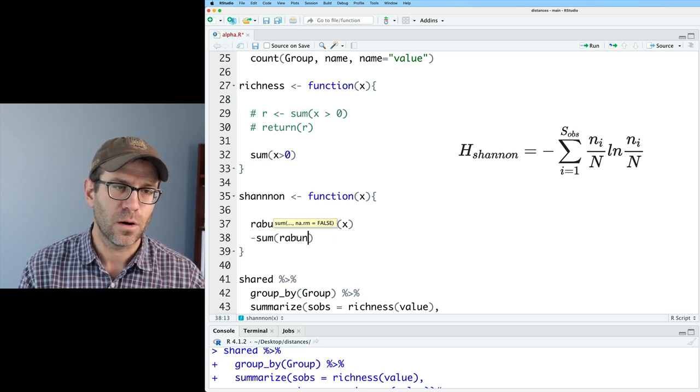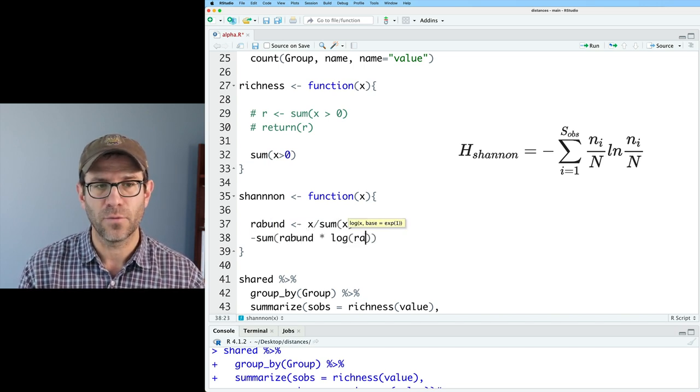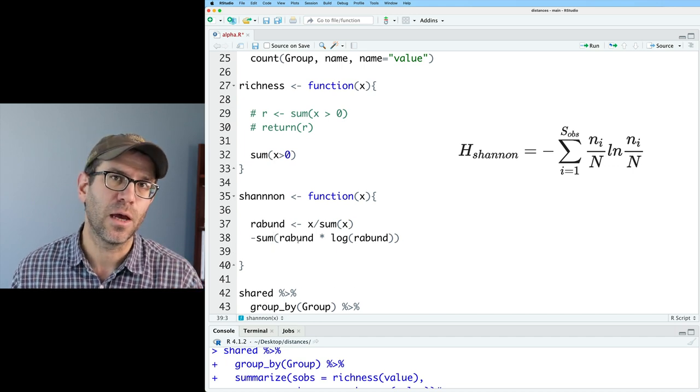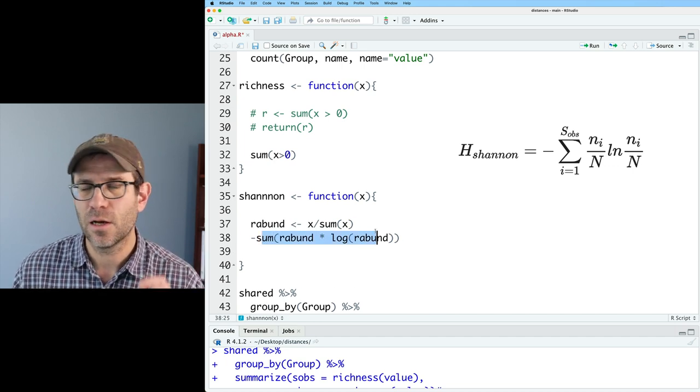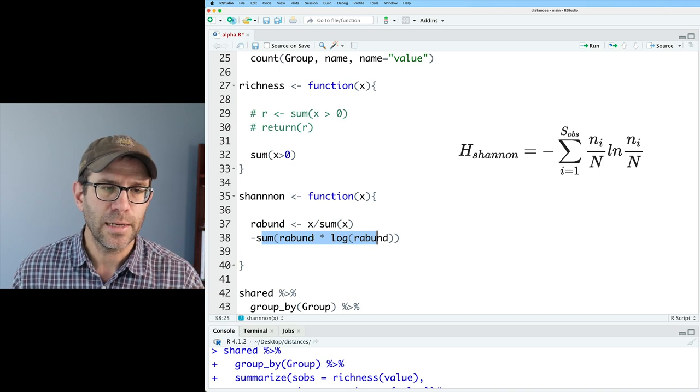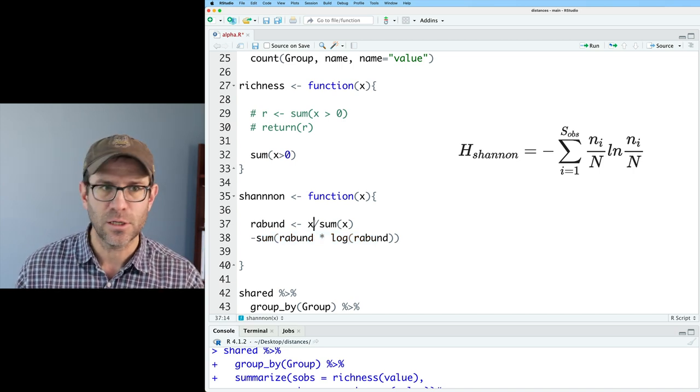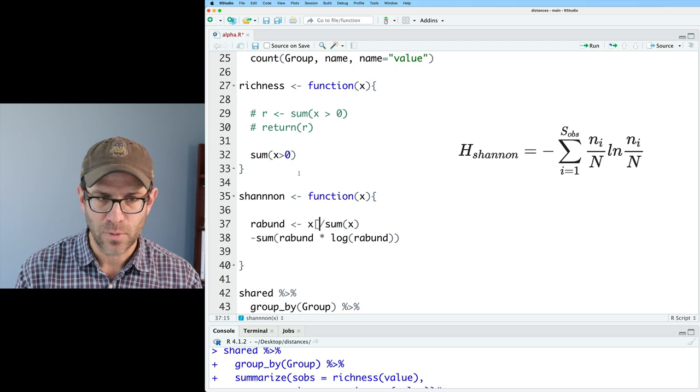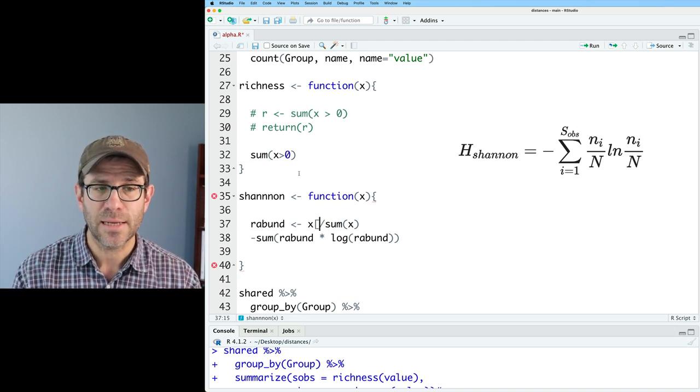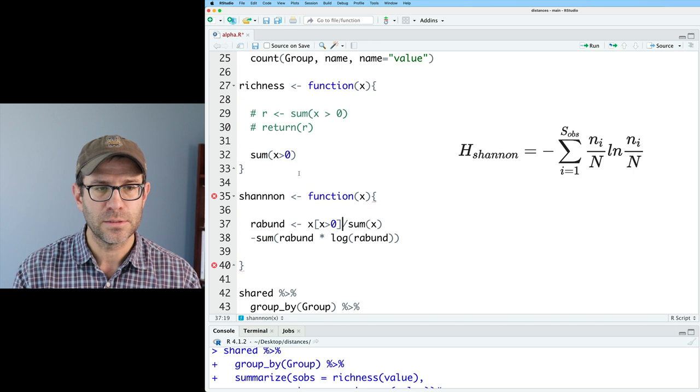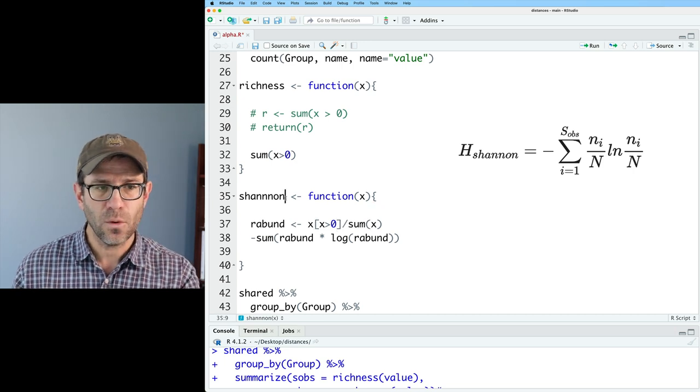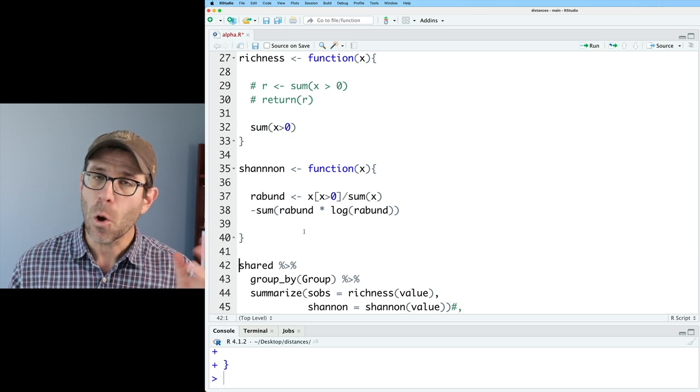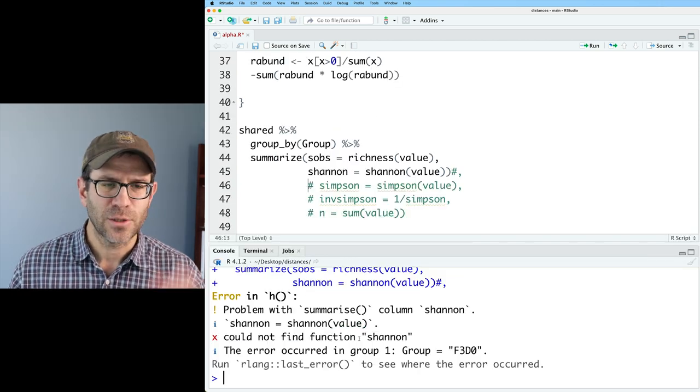Now the problem is going to come that when we calculate the Shannon value, which will be negative of the sum of r abund times the log of r abund, that if we have a 0 value for that r abund, it's going to cause all sorts of problems. So what I need to do is to limit this to the x values that are greater than 0. And we kind of saw how to do this up here already. But I can use square brace notation to say x, and I want x values greater than 0.